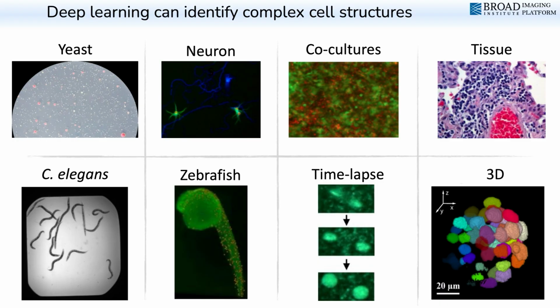And if you can quantify a phenotype you care about, then you can go and search for that specific characteristic in a very large collection of image data sets, typically these very large chemical screens that can be run in pharma companies. And that is a game changer in our ability to look for complex patterns in images, all right?